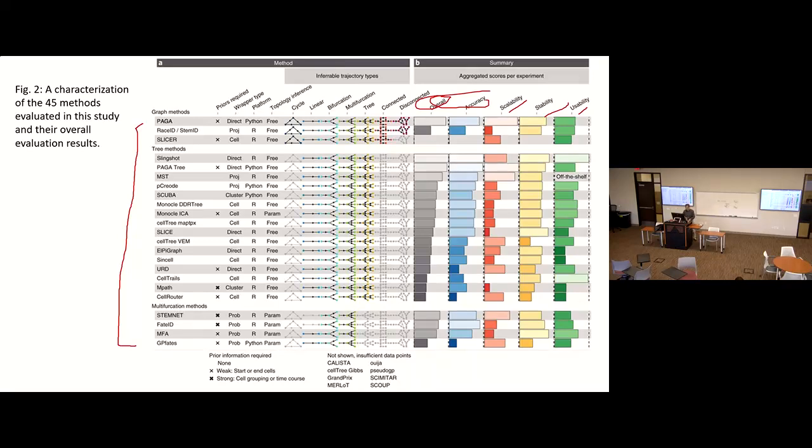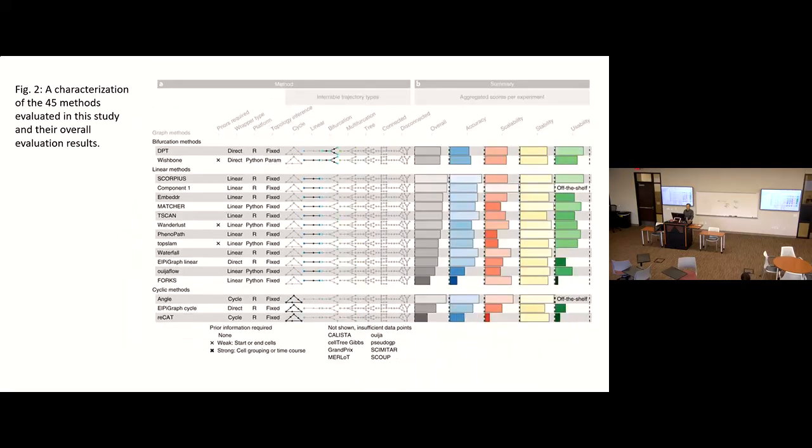Loading, okay. So let's continue with this evaluation study for pseudo-time analysis methods. This table just continues. I cannot put it on even one slide, so we have to cut it in half. So this is a really comprehensive review of all these methods.